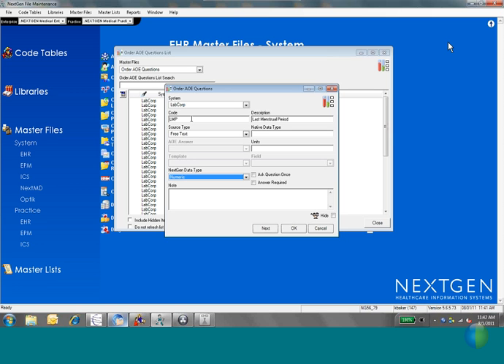There's going to be things like the source, for example, that might not be able to be asked once because you might have a specimen from their blood, you might have urine, you might have a tissue sample, so it all just kind of depends on the answer to the question. You also can decide if the answer is required, and therefore you cannot place the order and send it to the lab without an answer to this question. And that's kind of more going to be up to the vendor than you guys. But, you know, when in doubt, you can make it required so that you can make sure the information is sent properly. But the lab will tell you if they need the answer as a requirement to performing the test. If they don't need the answer, I guess then you can uncheck that box.